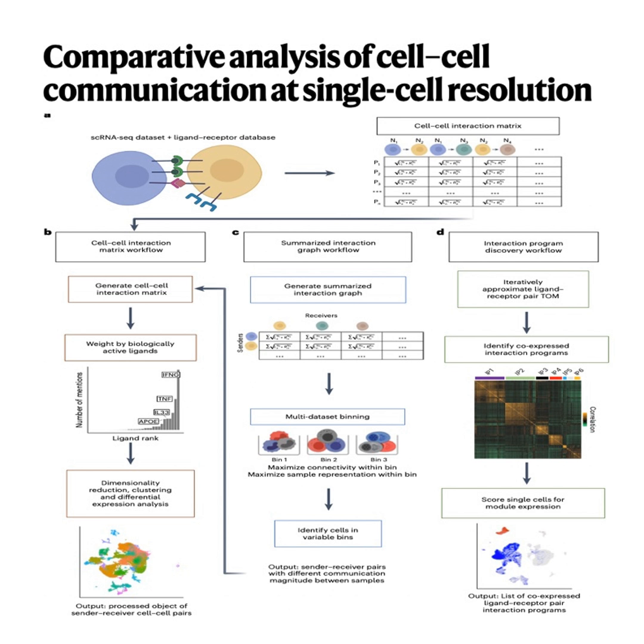In mice, the standard lab model, RSPO3 is thought to be produced mainly by lymphatic endothelial cells, or LECs. Okay. But in this human fetal gut data, Scriabin's single-cell IP analysis showed RSPO3 wasn't coming from LECs. It was primarily coming from a specific type of fibroblast marked by the gene GREM1. So a different cell type is doing the same job in humans compared to mice? Seems like it, yeah. A species-specific difference in how this critical stem cell niche is maintained. And that's the kind of subtle cell-type-specific detail you'd likely miss if you just aggregated all fibroblasts or all endothelial cells together. The single-cell resolution was key.